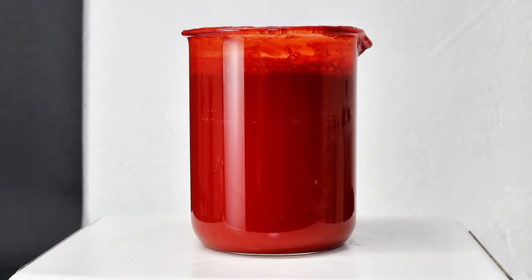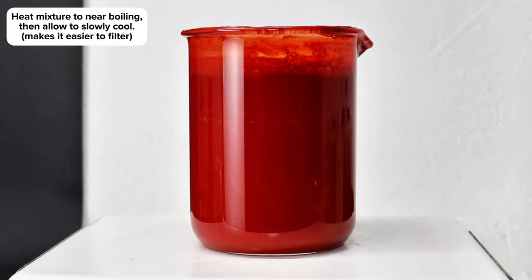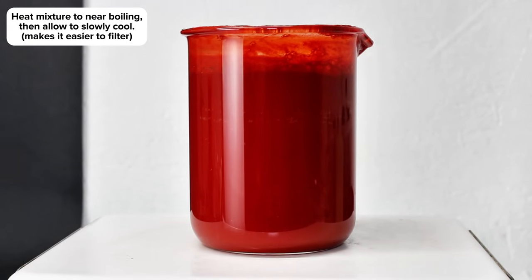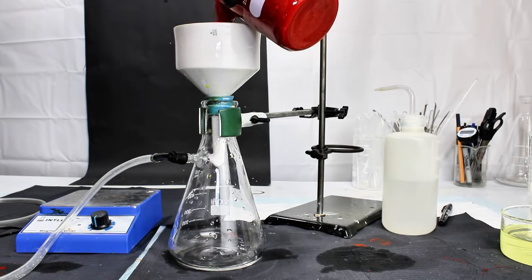After the mixture had spent an hour reacting, it was next acidified with a few milliliters of 2 molar hydrochloric acid. The mixture was then transferred to my hot plate and heated under constant stirring until it was nearly boiling. The idea here is that para-red is only slightly soluble in cold water, and dramatically more soluble in hot water. Even at 100 degrees Celsius, I don't have nearly enough water to dissolve it all the way, but I can dissolve enough that when it's allowed to cool back down to room temperature, enough will be recrystallized that filtration should be less of a complete nightmare.